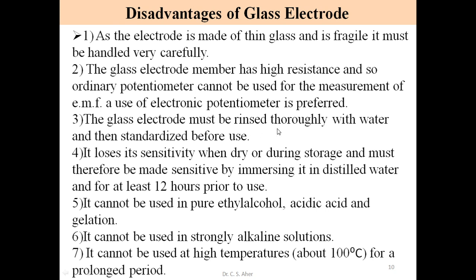Third, this glass electrode must be rinsed thoroughly with water and then standardized before use. See, these layers are formed inside and above this glass, and thus it is rinsed with distilled water before use to wash out that outer H plus ion layer. So that is also a disadvantage. Before use we should wash it. Actually it is a normal process. Before use, that glass electrode must be washed with distilled water.